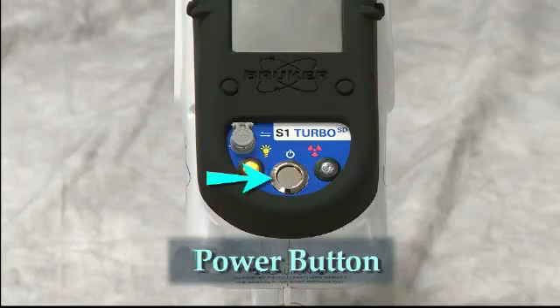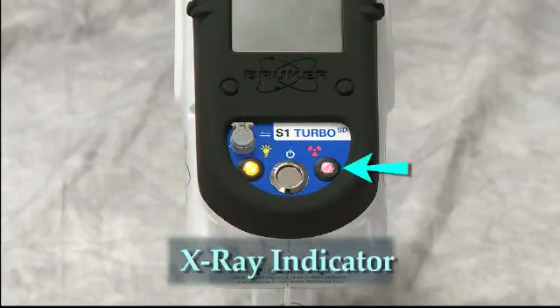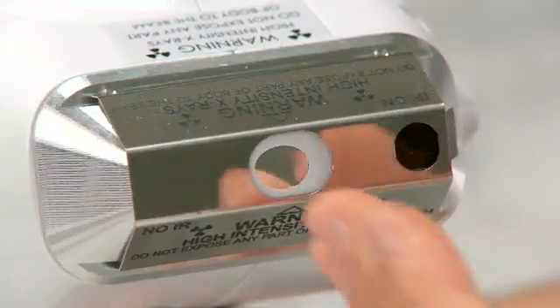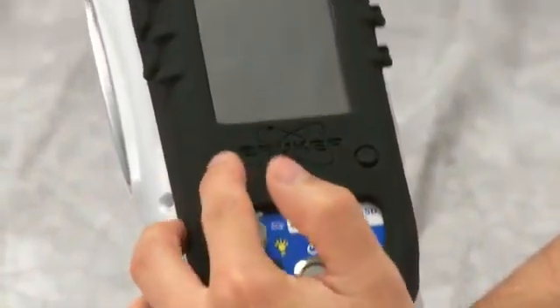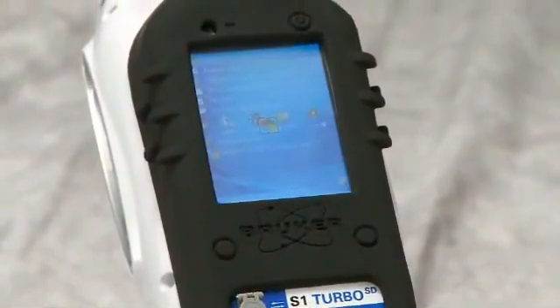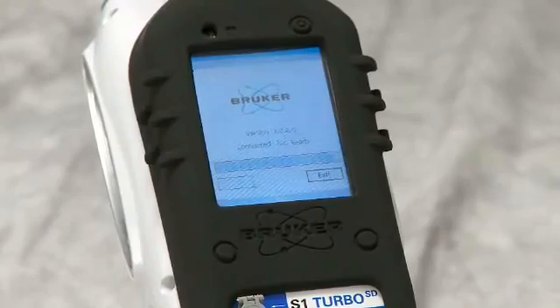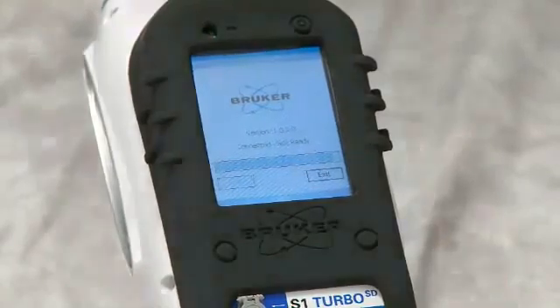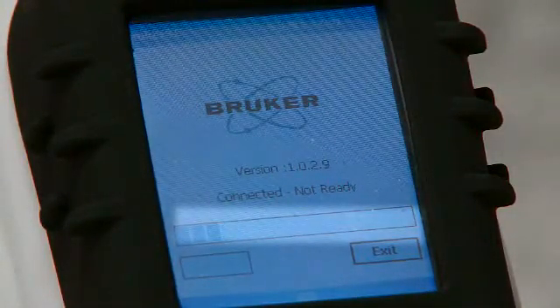The control panel of the analyzer has a power button in the middle, a yellow power light to the left which indicates the analyzer is on, and a red light to the right which indicates that x-rays are being generated. In the front of the analyzer are a measurement window and IR sample sensor. To start the analyzer, simply push the power switch on the control panel and then the left button on the PDA cover, which is a shortcut to the calendar button on the PDA. This will start the login procedure of the analyzer. Once the software is activated, the PDA and analyzer will connect, as indicated on the screen.